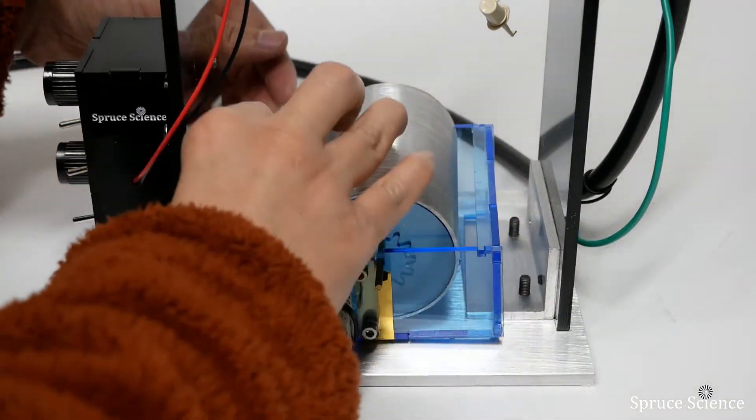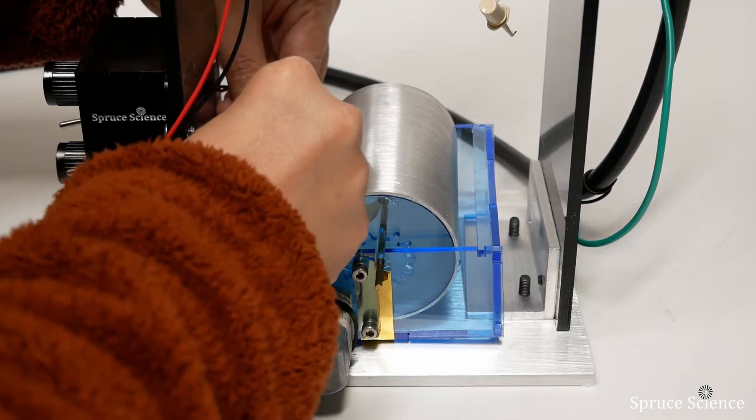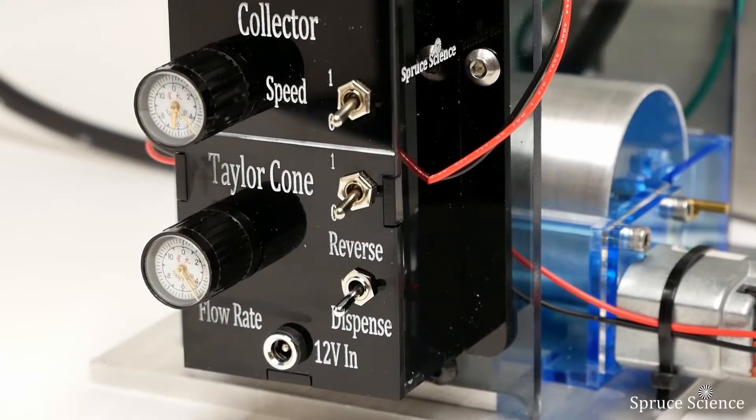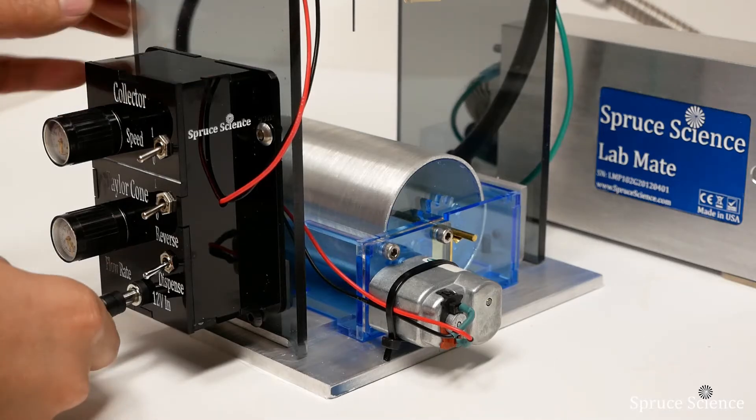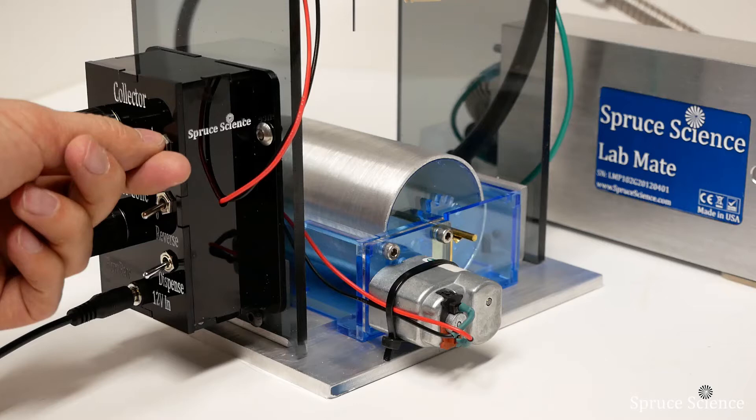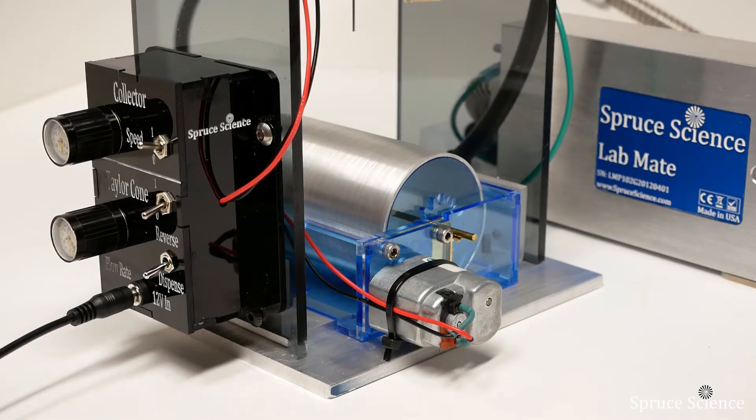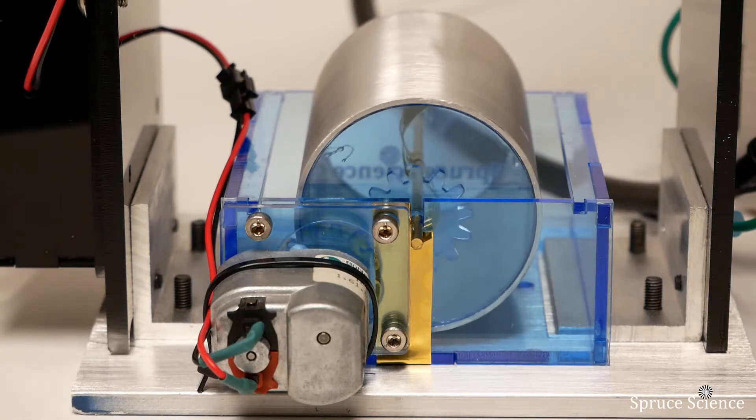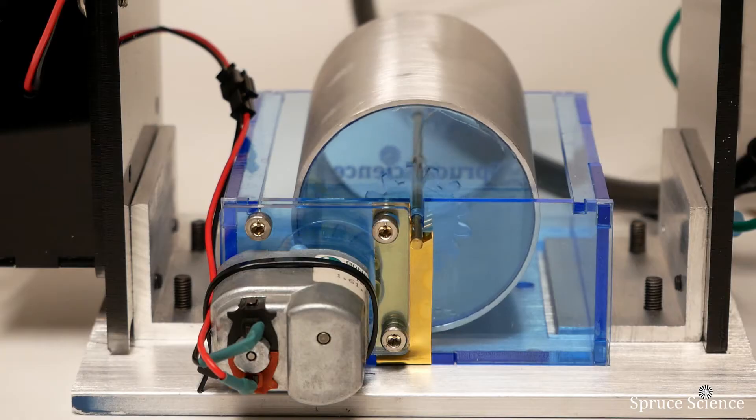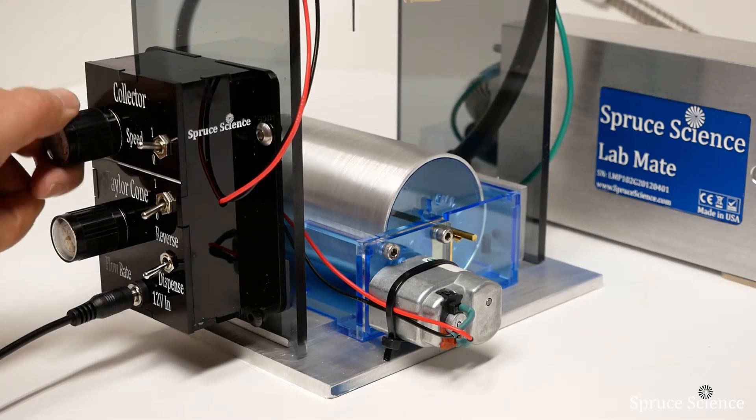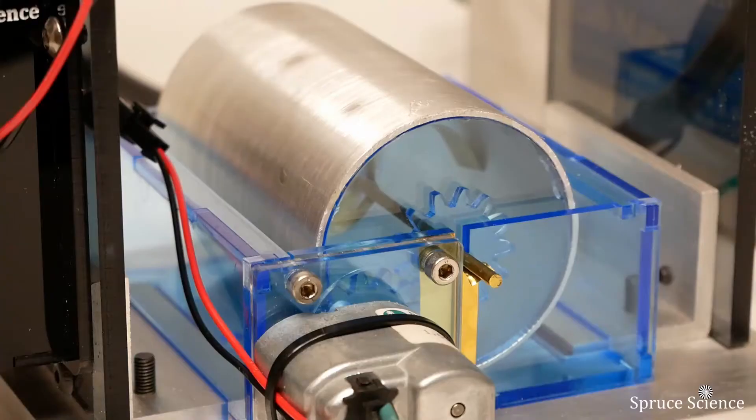Connect the DC motor to the controller. Plug in 12 volts and provide power to the control panel. Turn on the collector motor. The collector rotation speed can be adjusted by turning the dial on the control panel.